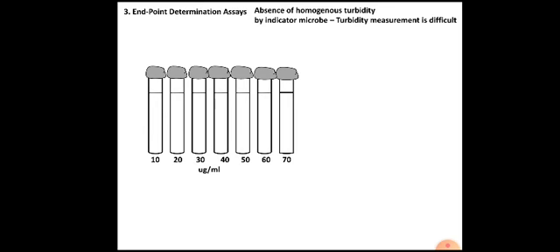The rest of the protocol is the same. Here also you have a standard reference compound, which is diluted as shown here. For example, in the case of an antibiotic, each dilution now contains the standard antibiotic, the growth medium and the indicator organism, that is an antibiotic sensitive organism.